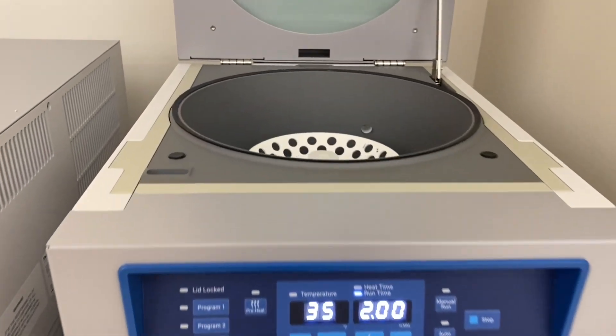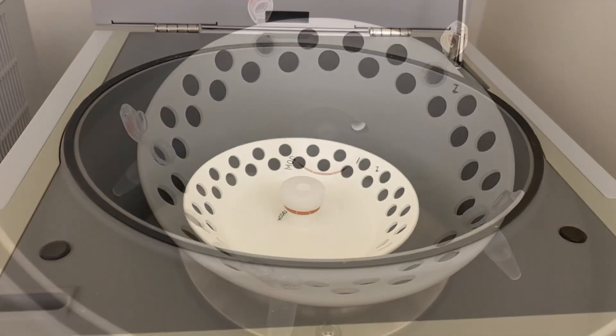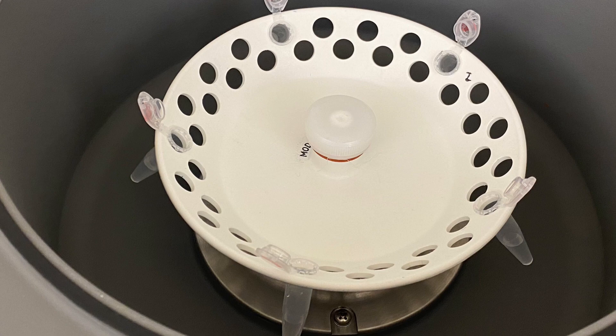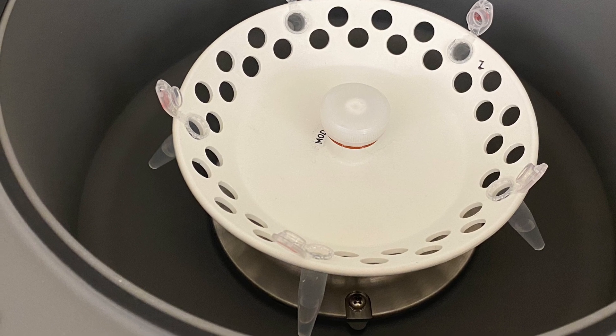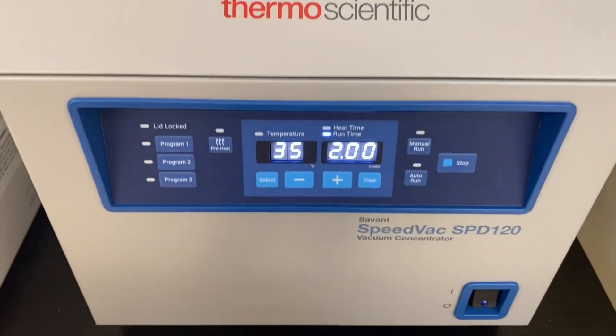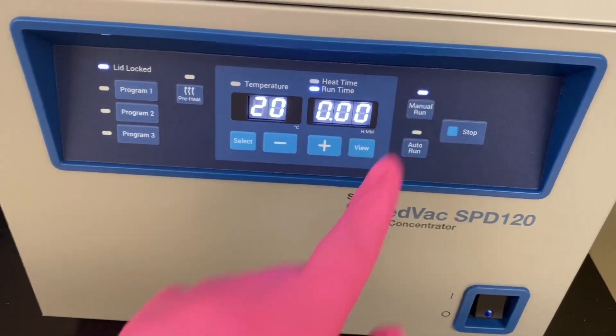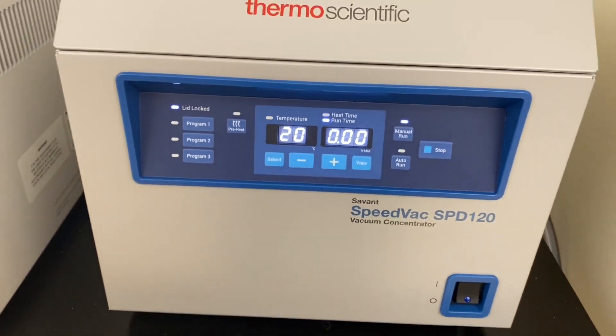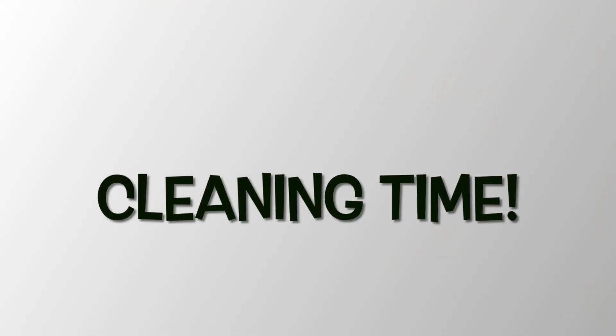So guys, all our hard work is done now. My last step is to dry my samples down. So I'm going to use the Speedvac. I'm going to dry my samples down until I see a nice white pellet. And after that, I will clean the pellet. The reason why we have to clean our peptide pellet is because mass spectrometers don't like detergents and salts.